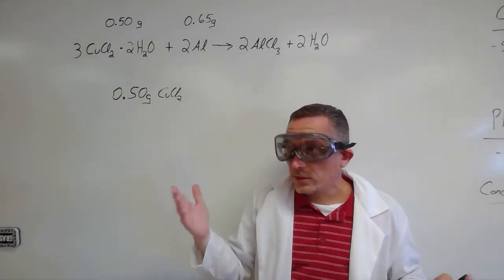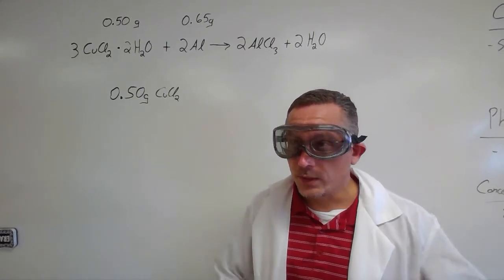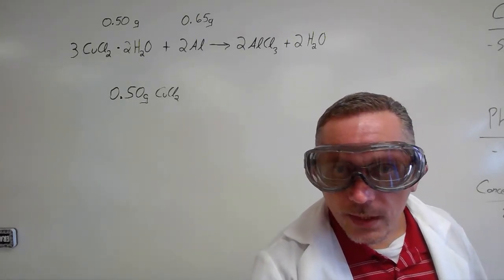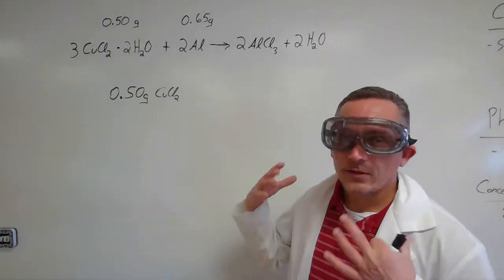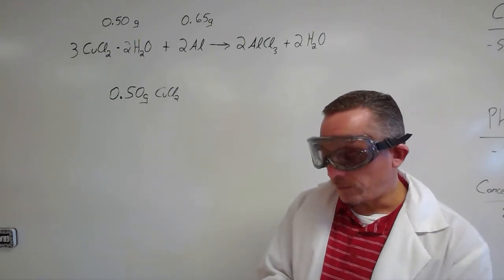And it actually makes it very easy because on the bottle that it comes in, it tells you what the molar mass is. So I believe it was 170.5 grams per mole. So we don't have to actually go and add it up. It's 170.5. It's also on the lab form there.